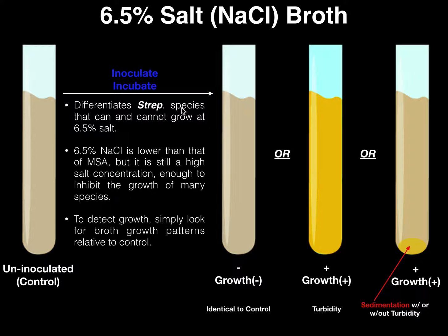The procedure is pretty simple. Here's the uninoculated broth before we do anything to it. We're going to inoculate and incubate as normal. When we pull it out of the incubator two days later, like we normally do, we're basically going to look for growth patterns.